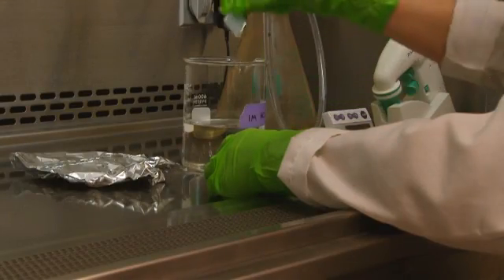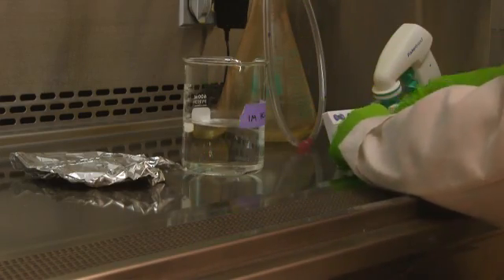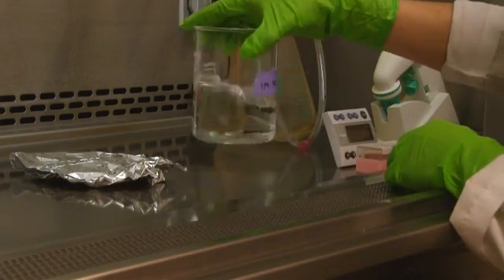Before starting the ICC procedure, we will demonstrate how to prepare cover slips and cell culture plates, followed by the plating of our cells.